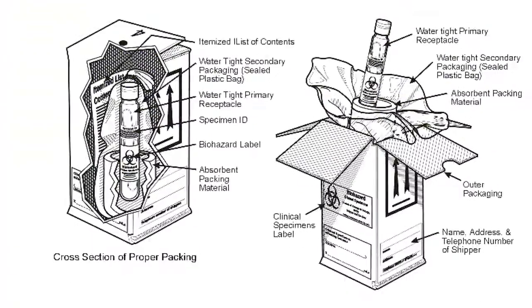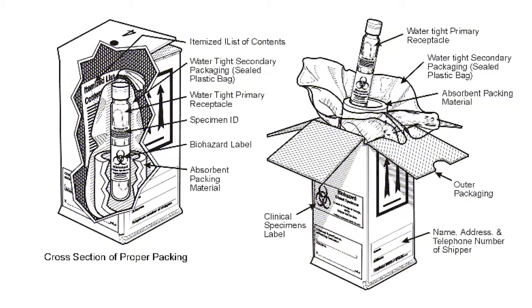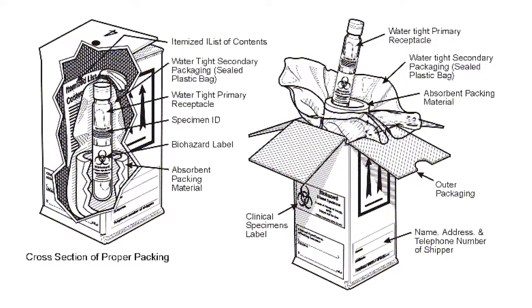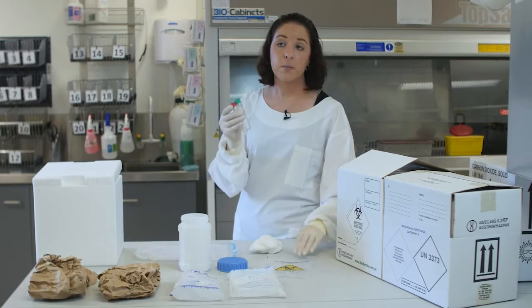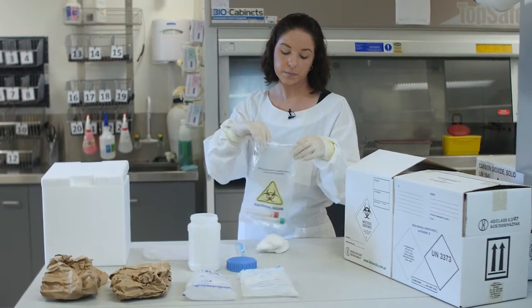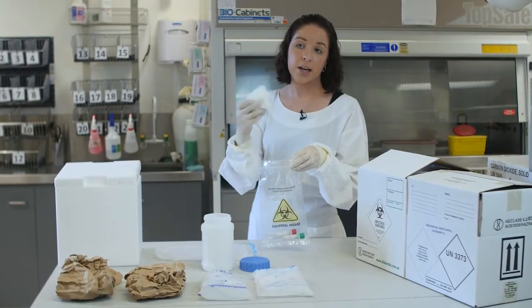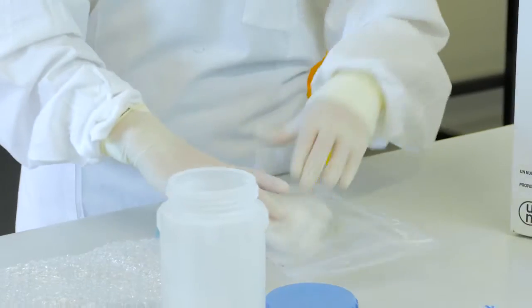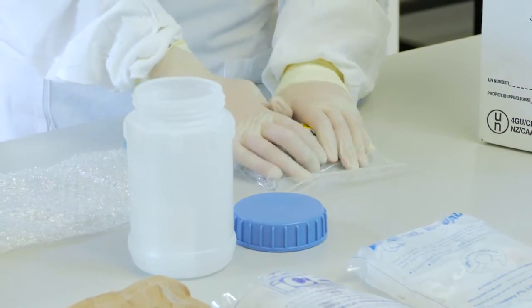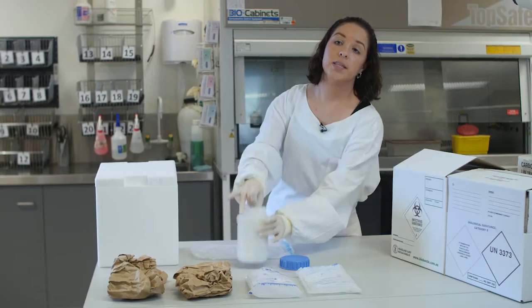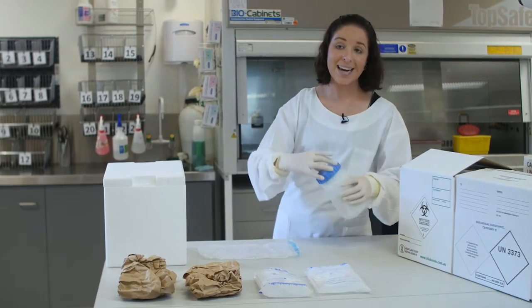Regardless of their classification, all biological samples must be packaged in a triple pack system. I'm going to demonstrate that for you now. Take your samples, place them into your biohazard bag, and ensure that you place adequate absorption material so that, should they spill or open during transport, the entire contents will be absorbed. This package is then placed into your secondary receptacle and is sealed.